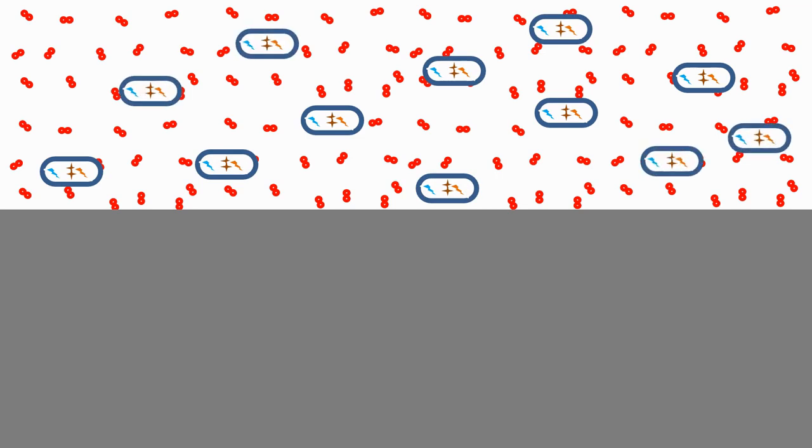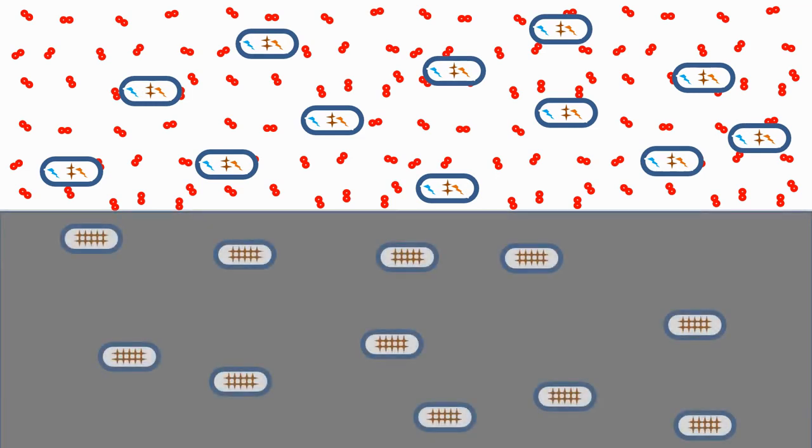The bacteria that persisted with iron-based cofactors like their forebearers are now called anaerobic bacteria and can survive only in the absence of oxygen. Now let us study the catalase test that detects the presence of catalase enzyme in the bacteria.